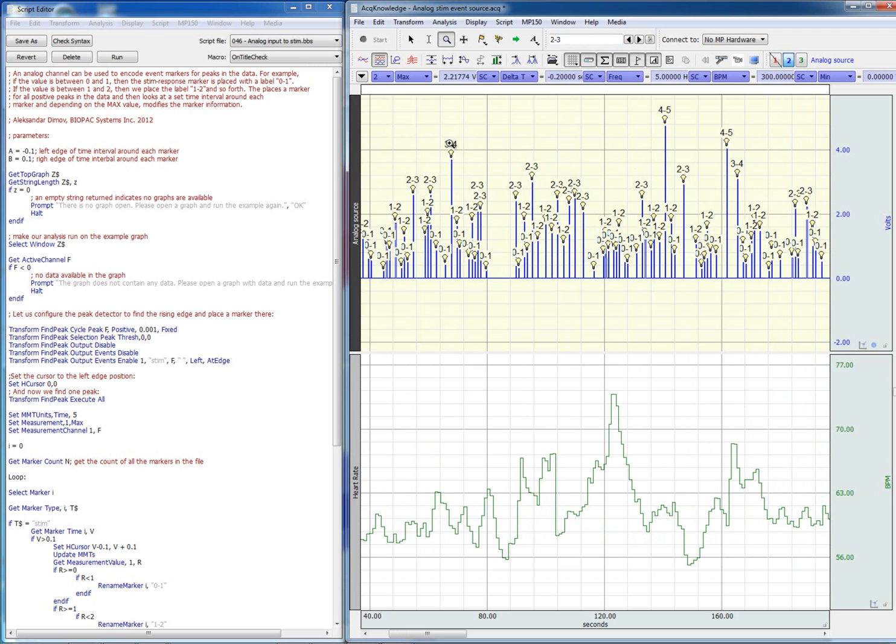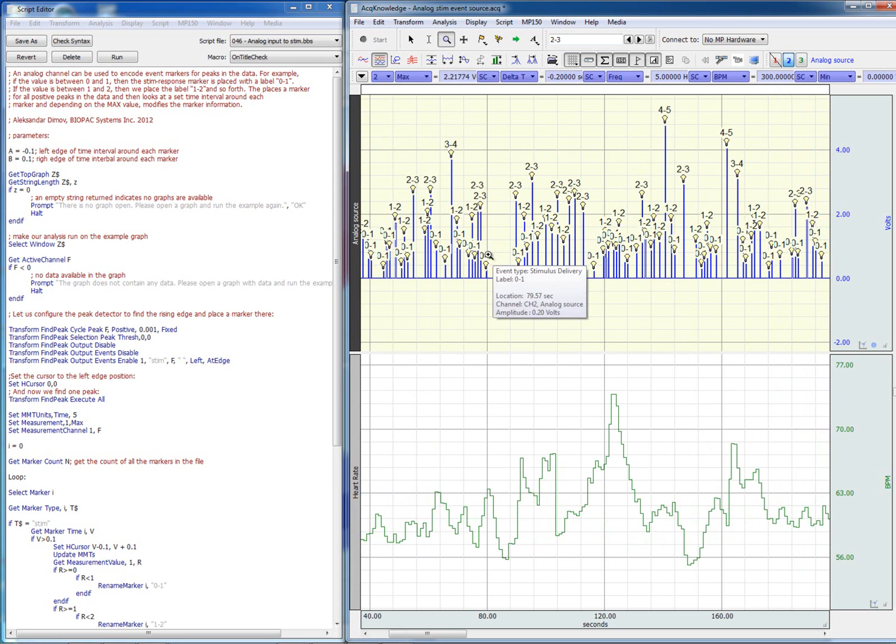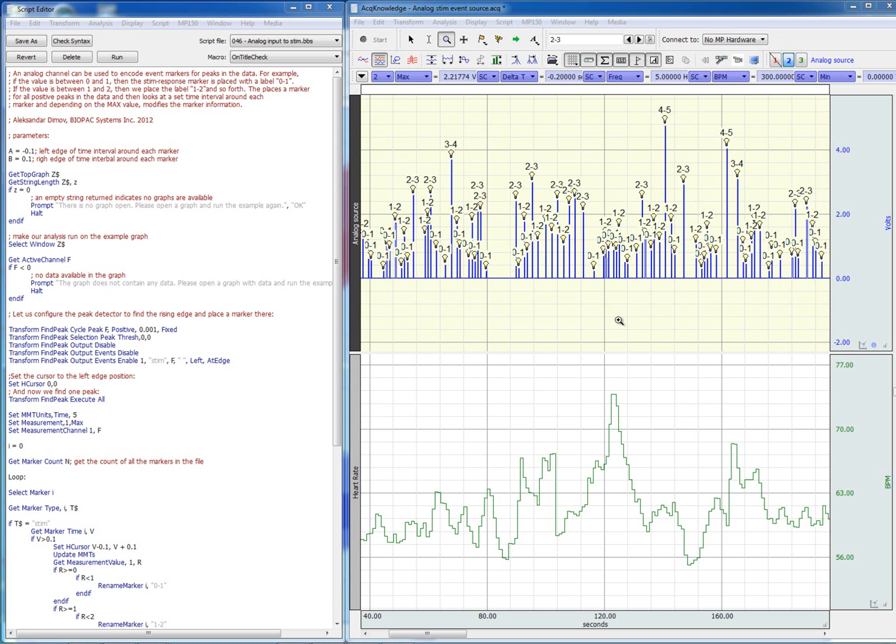Here is a pulse that falls in the range between three and four volts. Here is a pulse that falls in the range between zero and one volts, and so forth. Now that we have these markers, we can automatically obtain the instantaneous heart rate for every one of these types of labels.